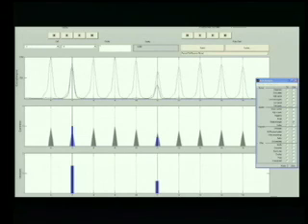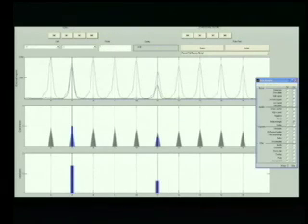I'd like to just take a moment and show a little bit more information on the True Allele System 2 display. We haven't spoken about this in detail. True Allele System 2 has 3 panels, as you can see. The top panel is the allelic ladder with the actual sample overlaid on top of that. Here are the sample alleles seen here and here over the allelic ladder. The second panel is called a quantitation panel, and it has the relative height of the peak in a spicogram format over the allelic ladder. And then the third panel is just visualizing the alleles themselves.